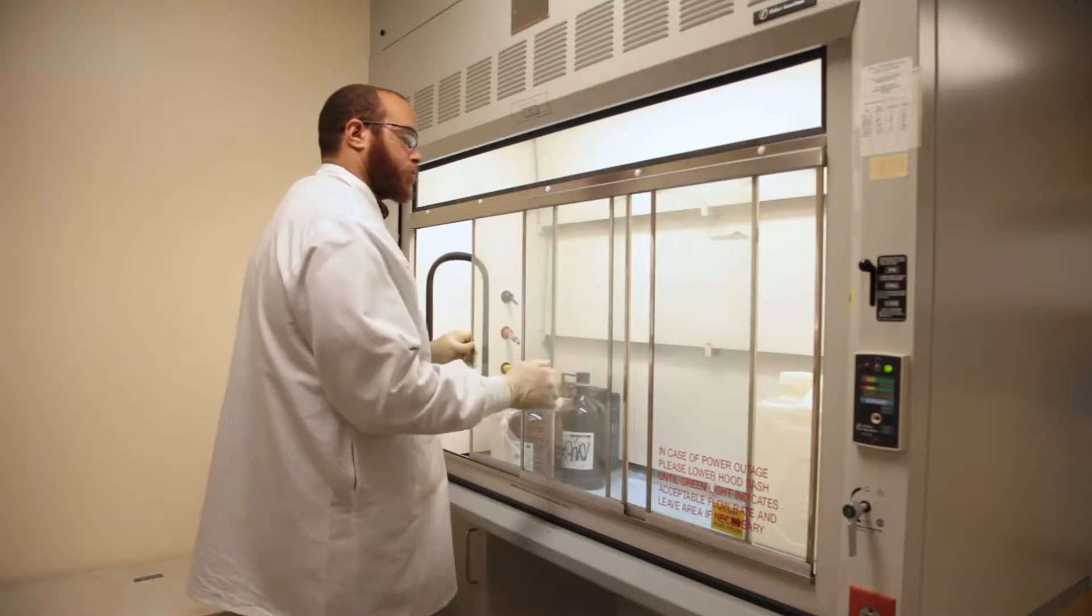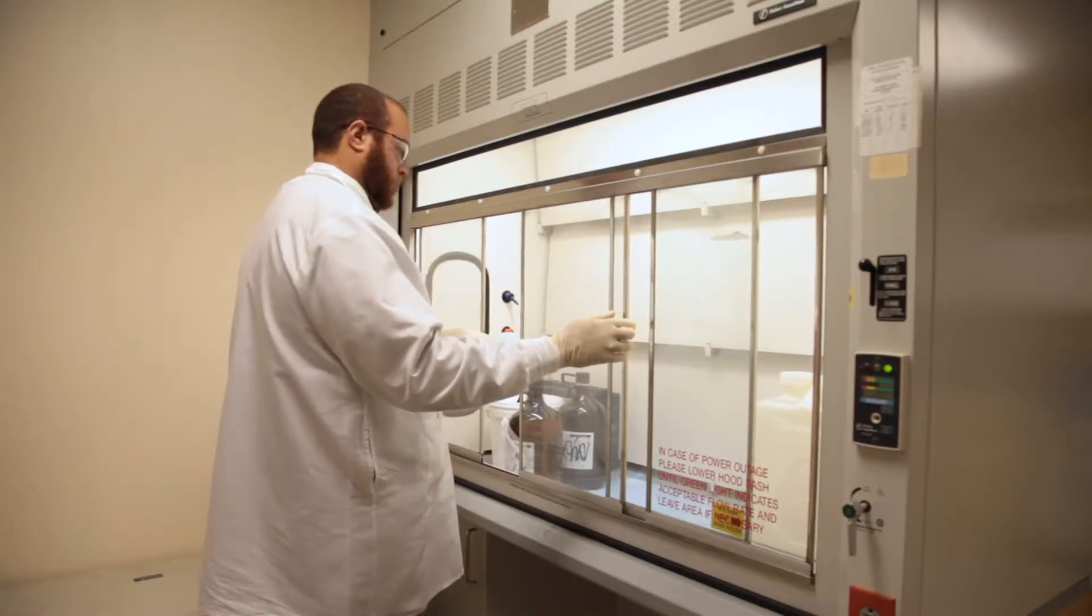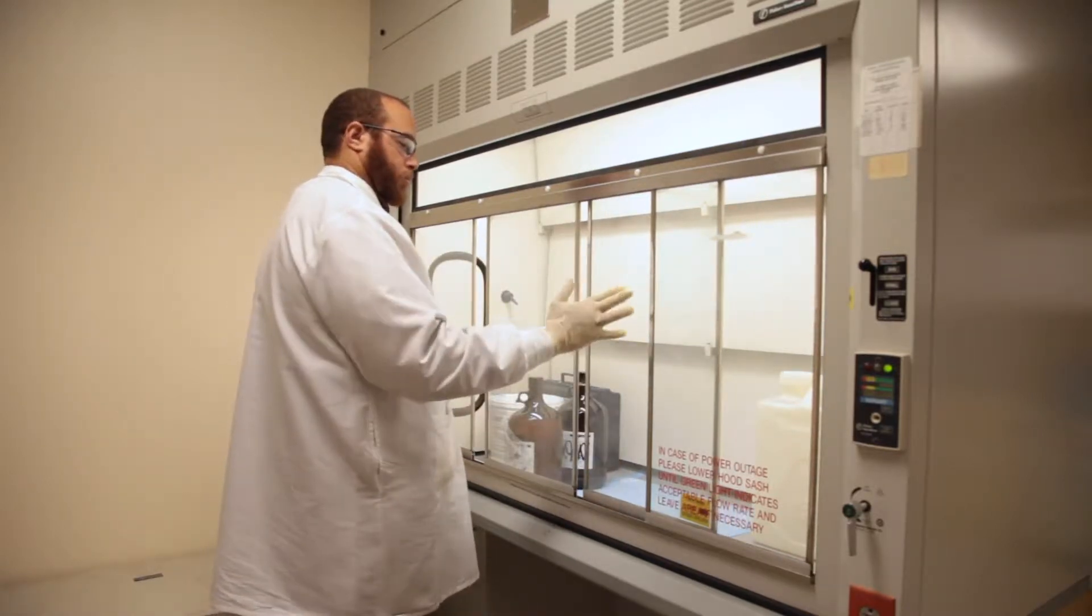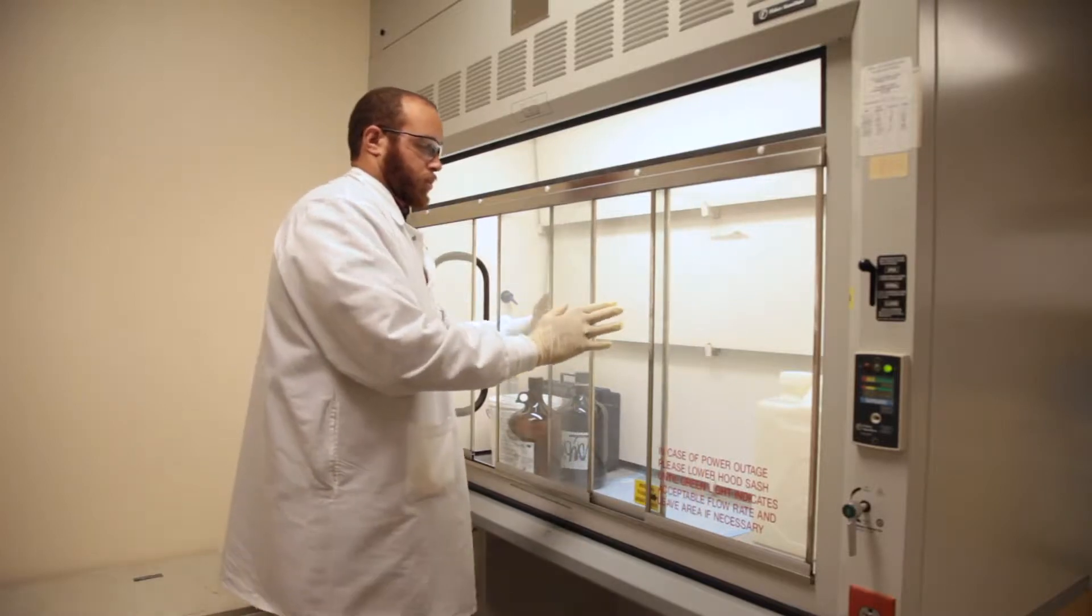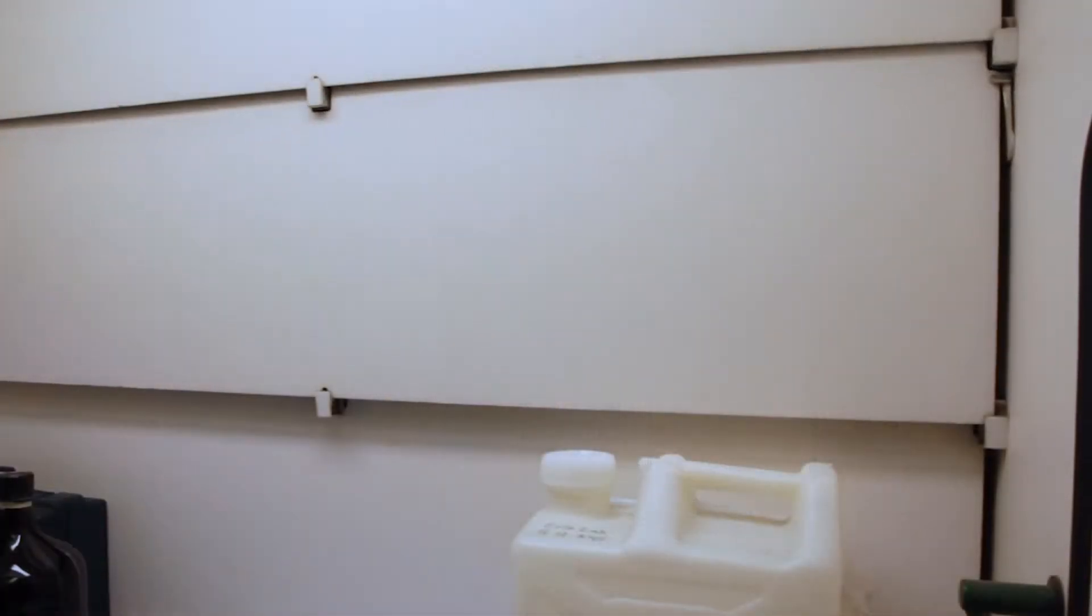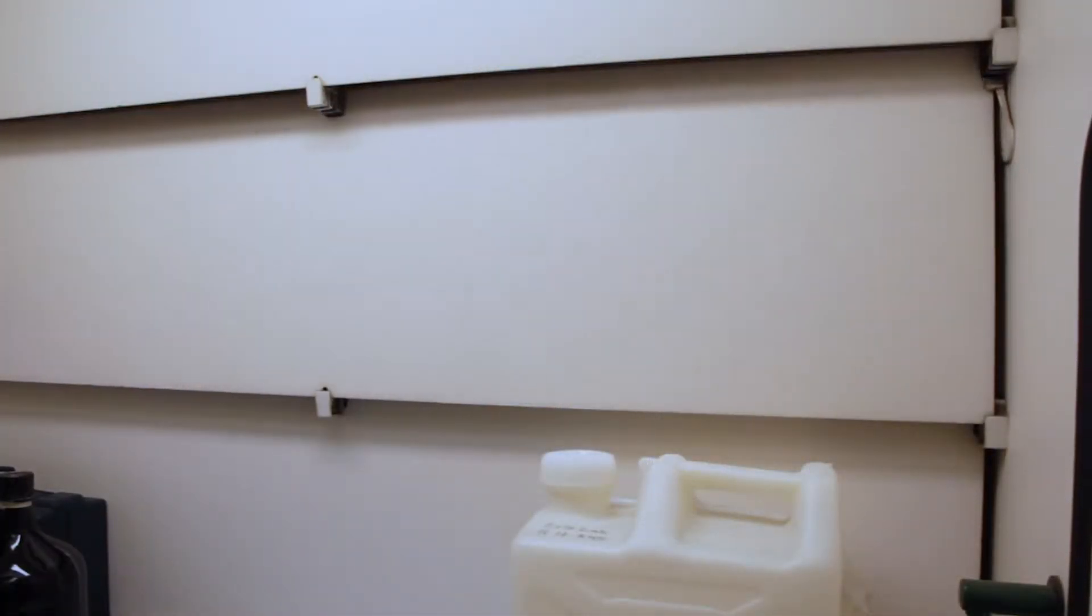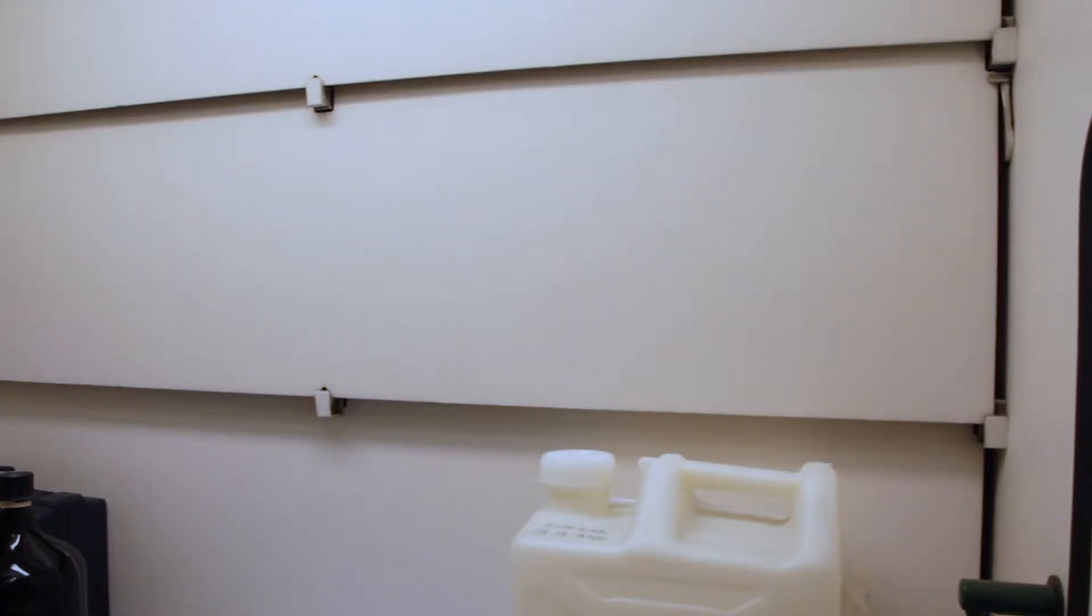Laboratory fume hoods are typically three-sided enclosures with an adjustable clear sliding window or sash. Components for a fume hood include baffles, which are movable partitions used to create slotted openings along the back of the hood body to maintain uniform airflow.